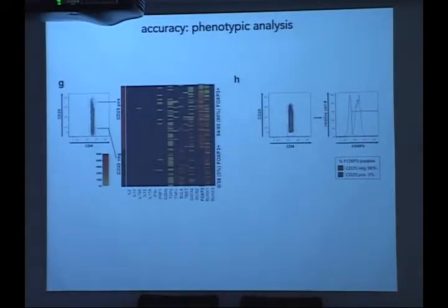And I know from our experience, for instance, with FOXP3, it's a pain to get to work by CyTOF. And it's really not even that easy by flow cytometry. And other transcription factors like TBET, GATA3, RORC, forget it. Forget trying to get all of them in one particular cell. And I think that we can do these pretty well. So this is FOXP3 analysis.